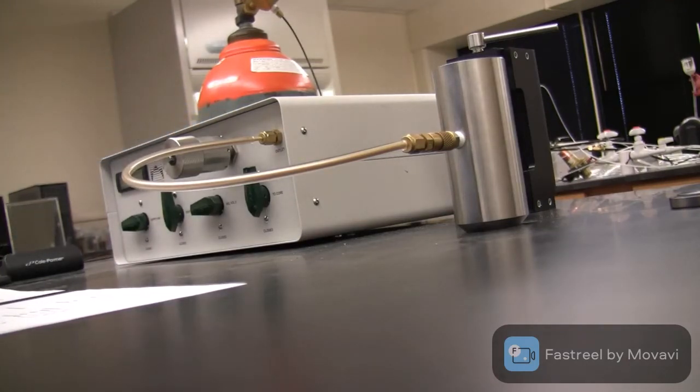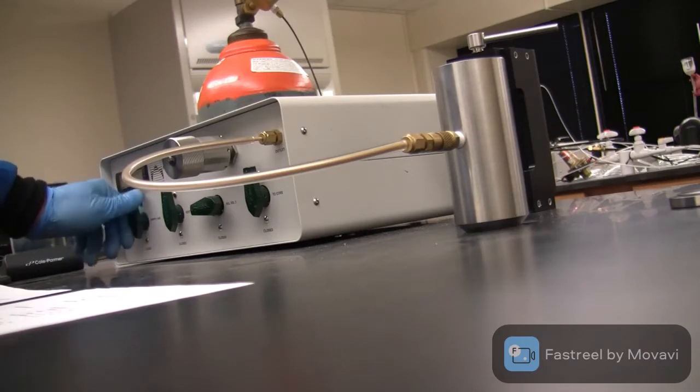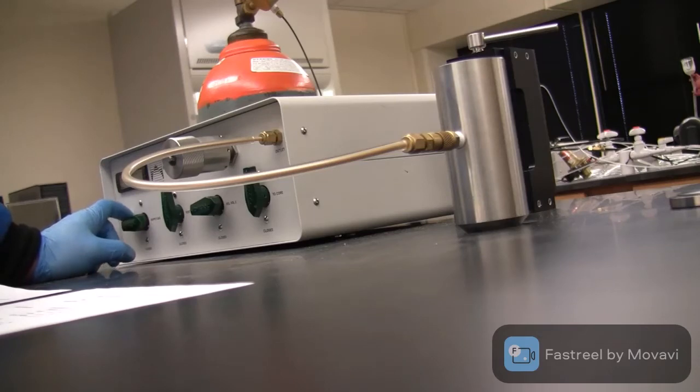The first step is to prepare the instrument, make sure it's not leaking or anything. So in order to do that, you open this, your supply gas valve, make sure it's open. Open means it's in the horizontal direction, closed is in the vertical direction. So make sure the valve is open, and then start to adjust the gas regulator until the pressure readout in here is around 95 psi.